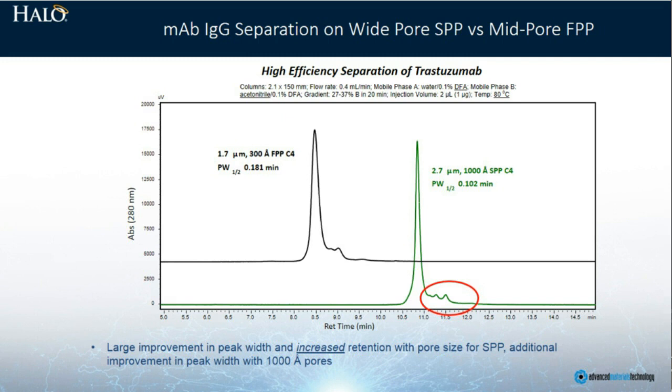We'll show some additional examples of the variants one can see in a therapeutic monoclonal antibody of this sort with this improved chromatographic resolution.